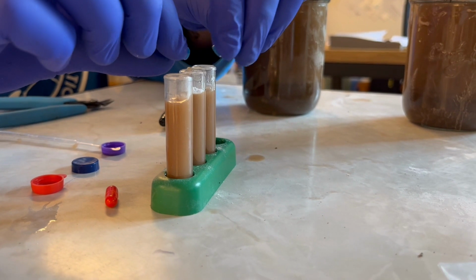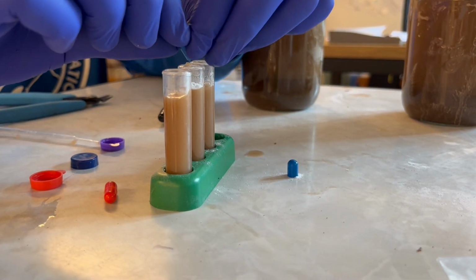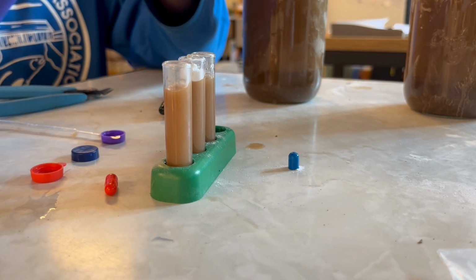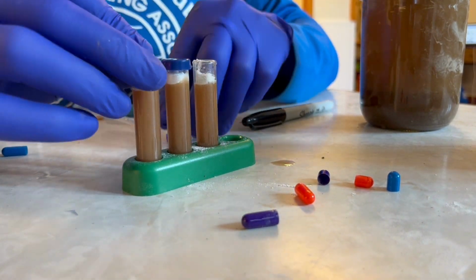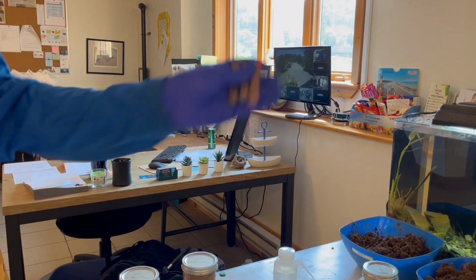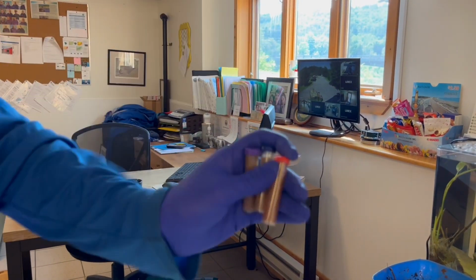Mix in the corresponding colored capsule. Nitrogen is purple, phosphorus is blue, and potash is red. Then cap the tubes and shake them vigorously. Let the tubes sit for 10 minutes and then compare them to the plant food chart to determine your level of each nutrient.